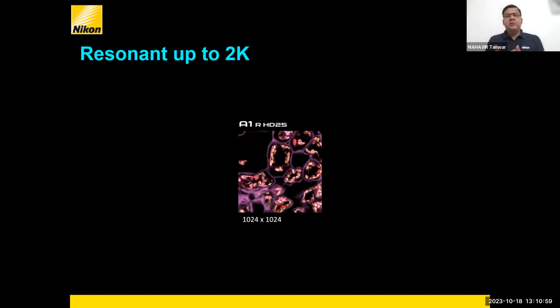So depending on the usage, you can always switch using software to high speed or high resolution. These mirror movements make it a high-resolution or high-speed scanner. The mirror for galvo has both X and Y movement. In the case of resonant, there is one fixed and one moving mirror. Those are the two technologies built into the system as an option depending on the usage.